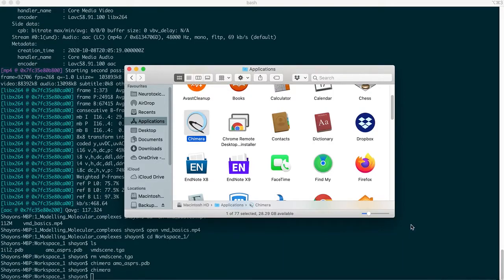However, we still need to change the AMO, or aspartyl-5'-adenosine-monophosphate, to L-Aspartic acid, and subsequently modify the stereoisomer L-Aspartic acid to D-Aspartic acid, so L-Asp to D-Asp. However, these can't be attained in a direct manner by VMD. So in this tutorial, we'll learn how to edit molecular structures using the UCSF Chimera program.